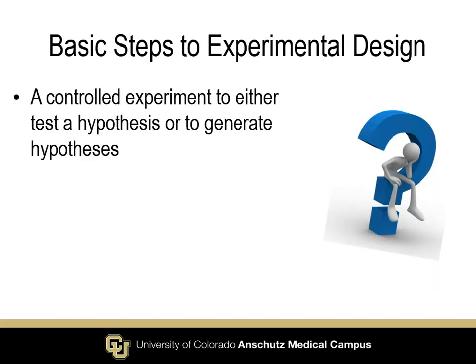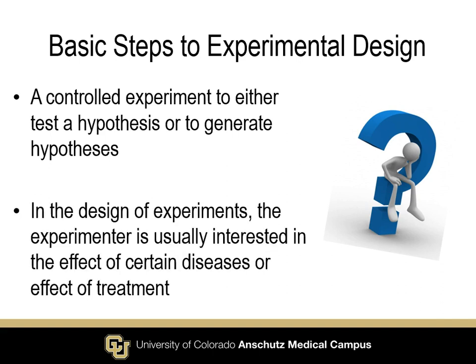So again, that brings us to the basic steps to experimental design. You want to have your experiment as controlled as possible so that you can either test the hypothesis or generate a hypothesis. Obviously if your experiment's not very controlled, then you don't have much faith in the results that you're getting. Usually the person doing the experiments is interested in the effect of certain diseases or the effect of treatment, or if you're not clinical, if you're in plant metabolomics or another aspect, you may be interested in the effect due to something.